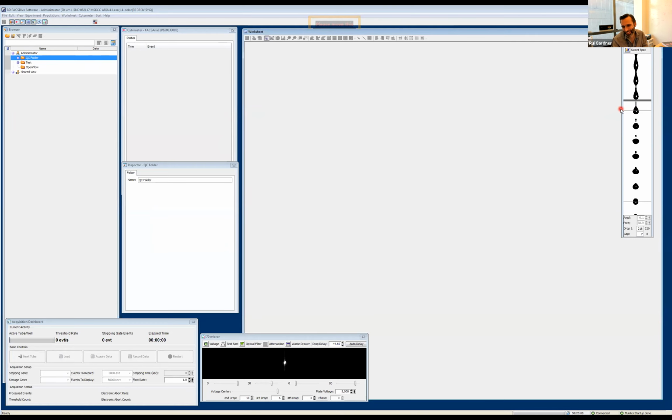Yeah, we won't do that now. I could do it for educational purposes, but it might knock things out, so I won't do that for today. Maybe I'll wait till the end. And here is that thin line that Rui is talking about. Now that I put the spotlight on, you can see it a little better, because I was trying to click before and it changes some of the options in that window.